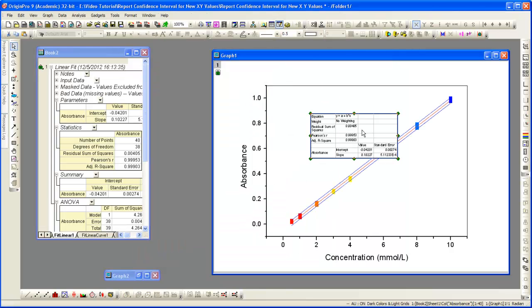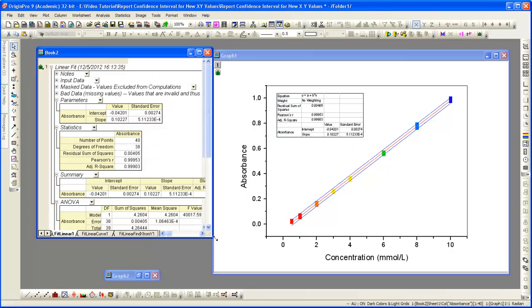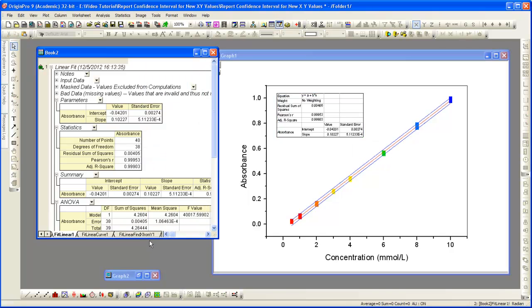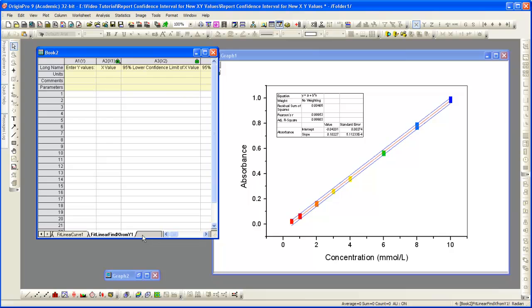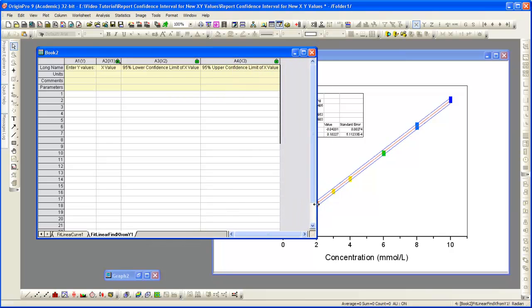Origin performs the linear regression analysis. In the raw data workbook, two new sheets were added. In the last sheet is the Find X from Y. We enter in an absorbance value.